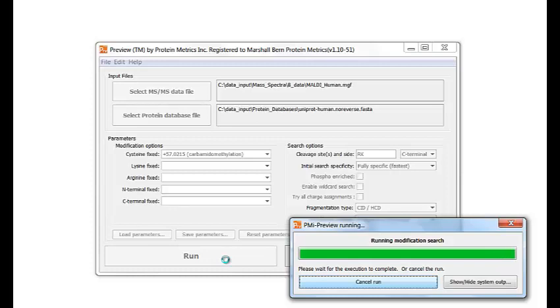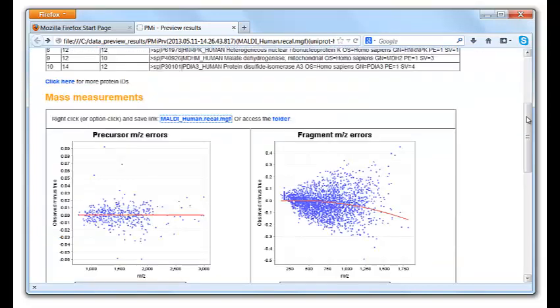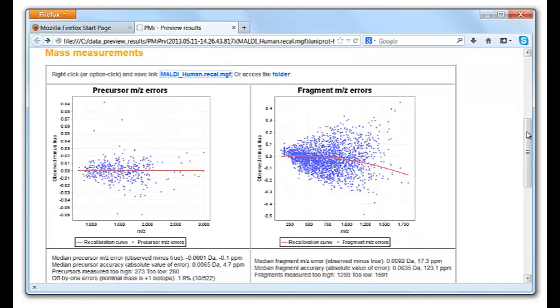When Preview is done, it pops up an HTML page with its findings. At the top of the page, you will see a list of the proteins with the most spectrum matches. Lower on the page, you see a scatter plot of the mass measurement errors. Preview automatically recalibrates the mass spectra to remove systematic mass errors, and its recalibration curves are shown in red here.